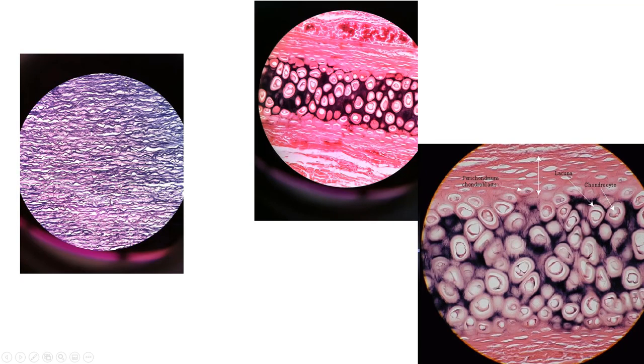Here we have elastic connective tissue. So it stretches, with these dark wavy elastic fibers. The primary place we have this is in big blood vessels like the aorta, which blood goes into when it leaves the heart.